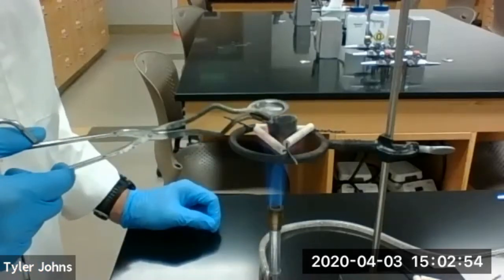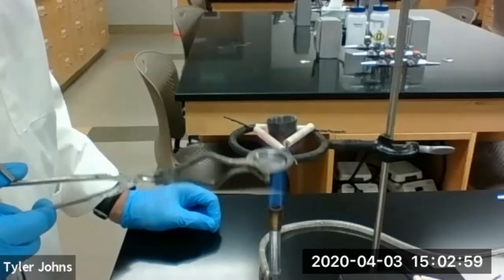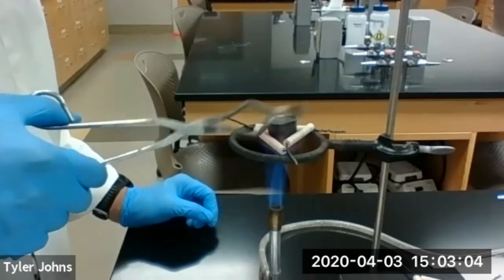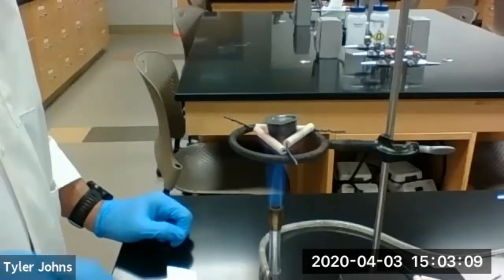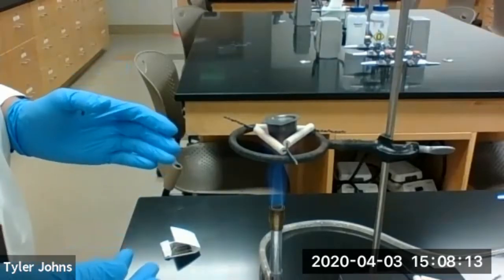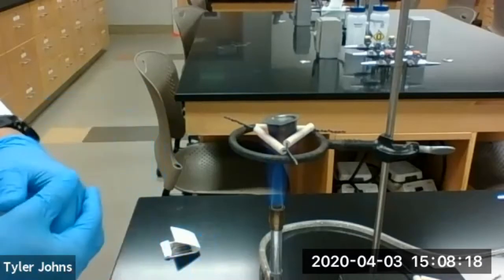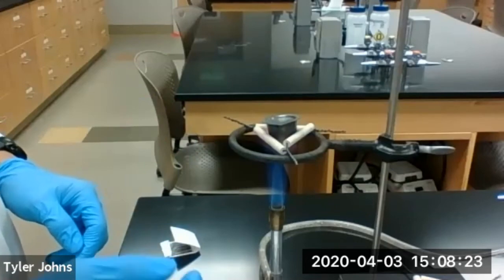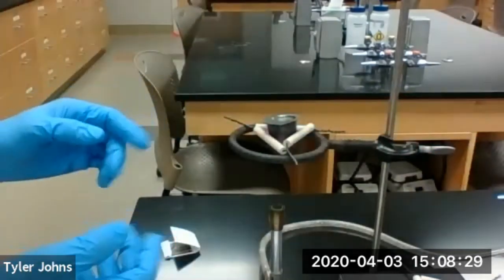We're going to cover the crucible and heat with the Bunsen burner for an additional five minutes. We'll let this heat for five minutes. Our crucible has been heating for five minutes and the bottom of our crucible has been red hot. So we're going to turn the burner off and let the crucible cool until it is just barely warm to the touch.